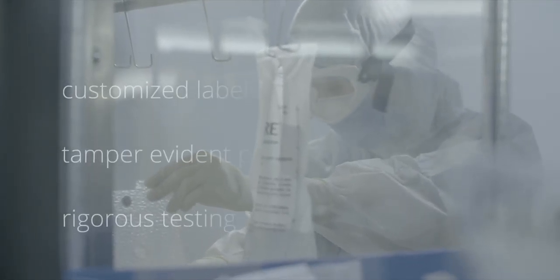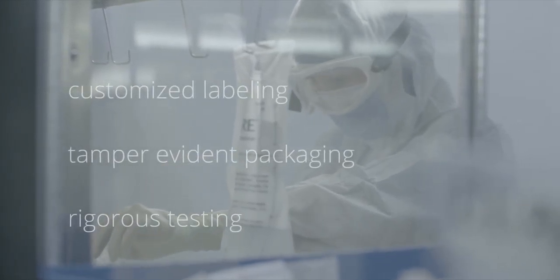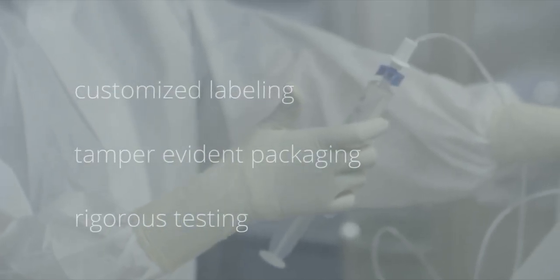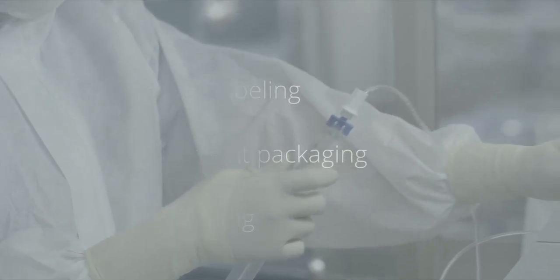And our efforts to safeguard patients extends beyond our FDA-inspected CGMP facilities. We provide customized labeling, tamper-evident packaging, and rigorously test every batch of product produced.